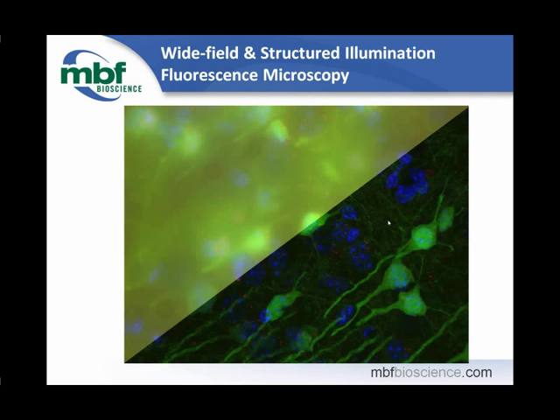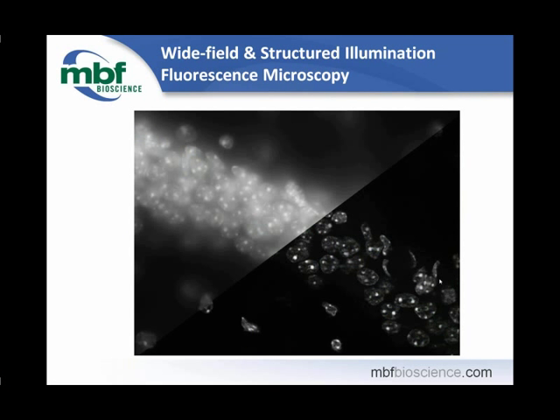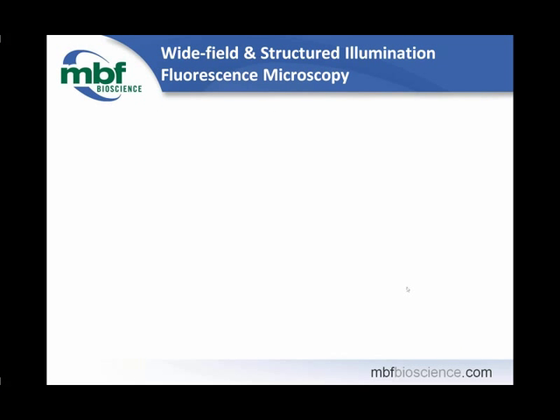You could see here that a wide field image incorporates a lot of light that is above and below the focal plane of your region of interest, whereas a structured illumination device will give images that are much sharper in X, Y, and Z and allow the user to define objects of interest much more clearly. In regions of anatomy where cells are very densely packed, you can see the difference right away.